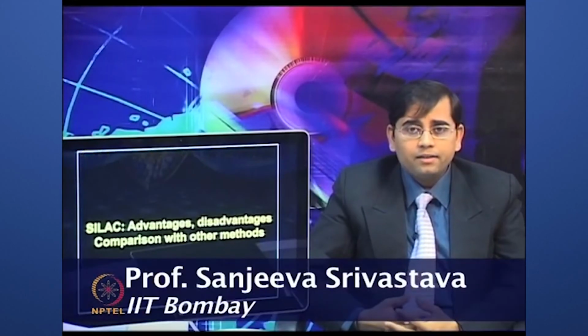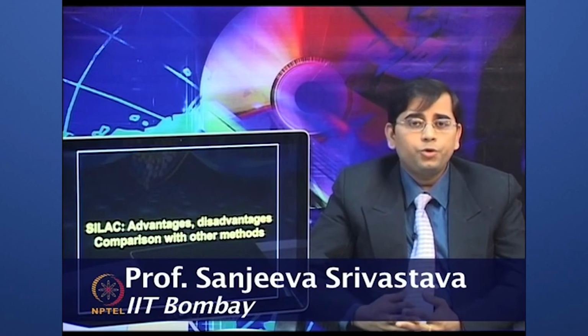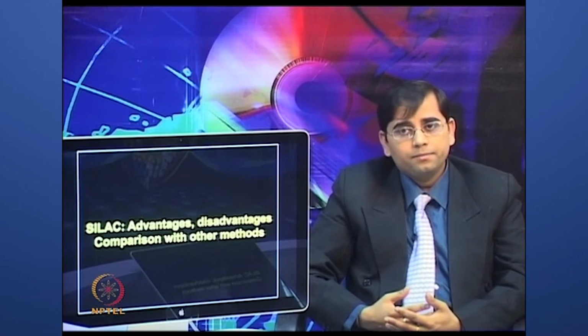So, as we have discussed and realized, the SILAC method is very simple and robust, and it labels the entire proteome without chemical derivatization and with fewer sample handling steps.